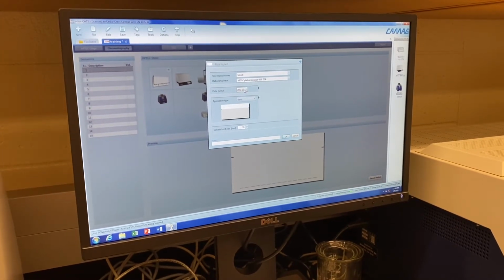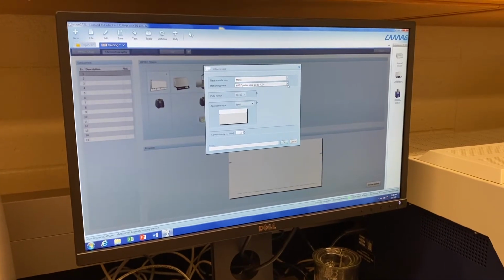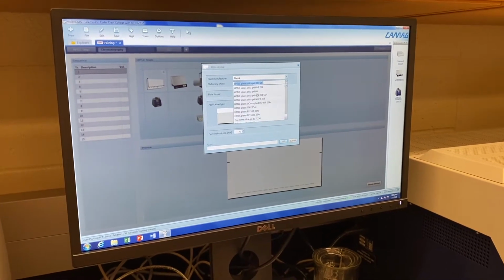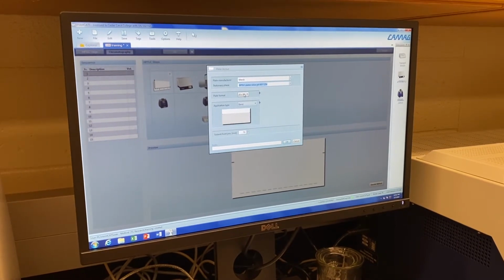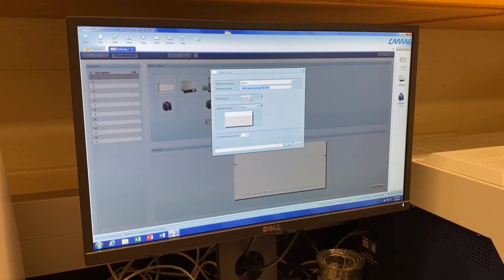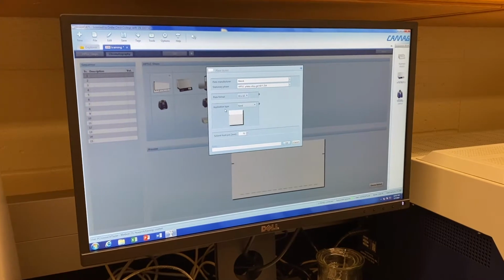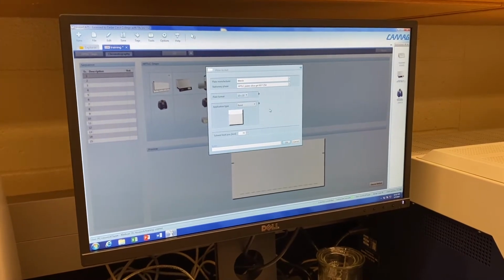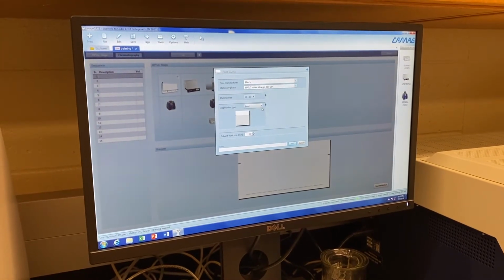So right here you can choose what kind of stationary phase or what kind of plate you're using. They have a bunch of selections for you. And the plate format by default is 20 by 10, which is the rectangular one, but I'm using a 10 by 10 today, so it's gonna be a square. I'm applying my sample as bands, so you can see the tiny gray little area down there.